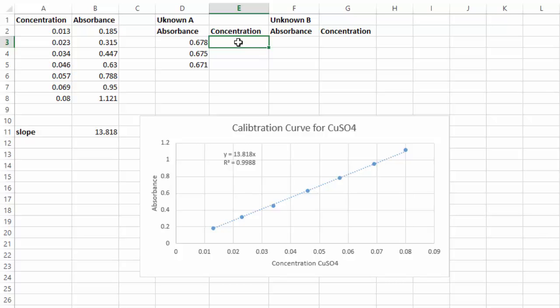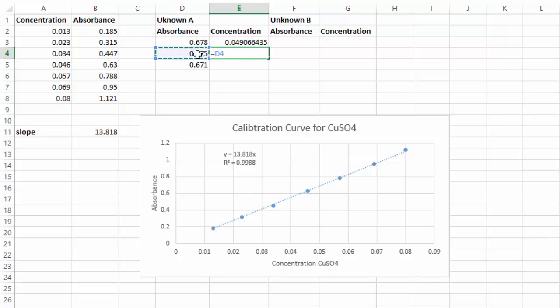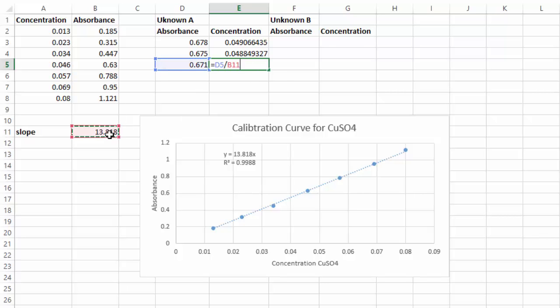Basically, dividing y (my absorbance) by 13.818 gives me my concentration. In Excel I can do the same thing — you can do this by hand in your notebook or in Excel, but if you do it in Excel make sure you put in the formulas. I'll use equals, take my absorbance (D3), and divide it by my slope (13.818). That gives me a concentration value of 0.04906. I'll do the same for the other two absorbances.